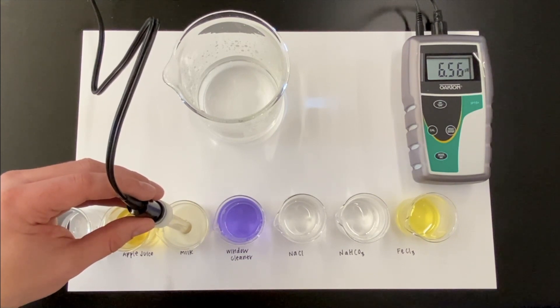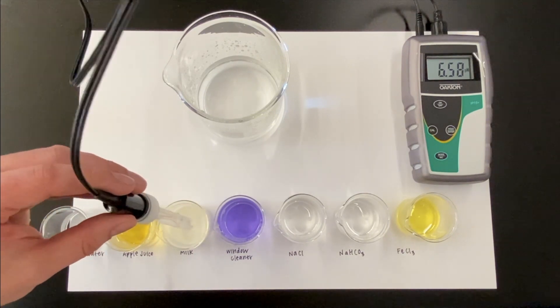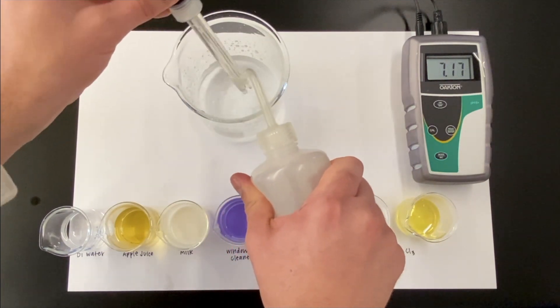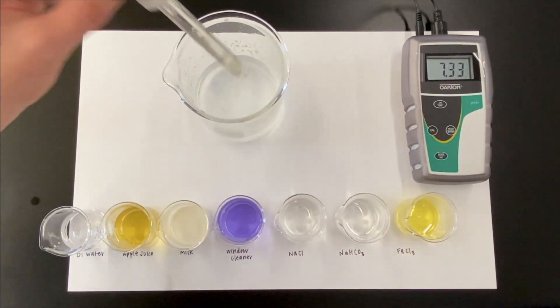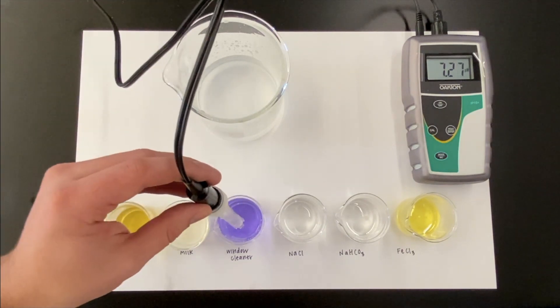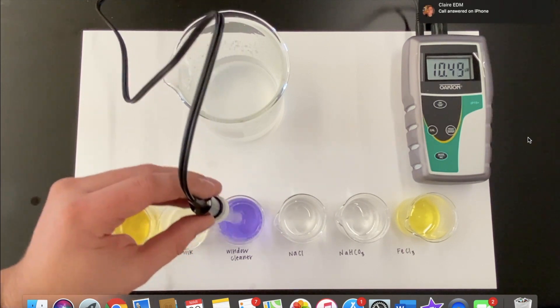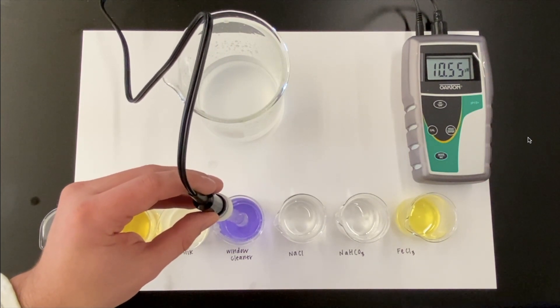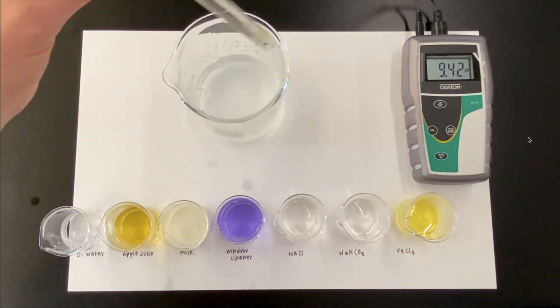Milk is a little acidic — a little more acidic than water, surprisingly. You may have heard that drinking milk helps with heartburn or stomach acid; that actually may not be the case. All milk actually is a little bit acidic because all milk has a little bit of lactic acid in it. For window cleaner, still nice and basic — pretty high pH, probably has some cleaning agent like ammonia in it.